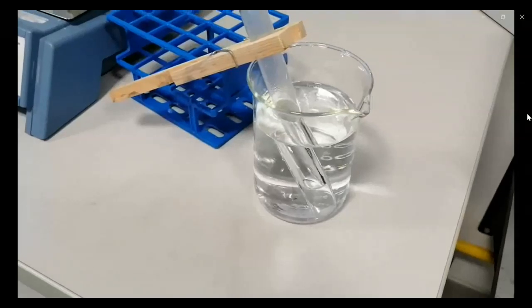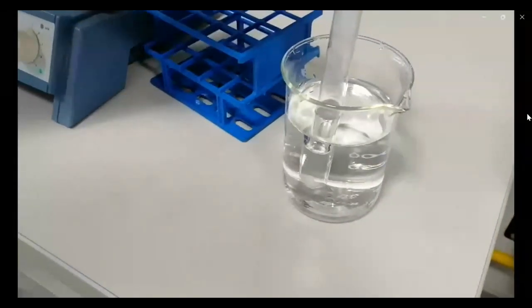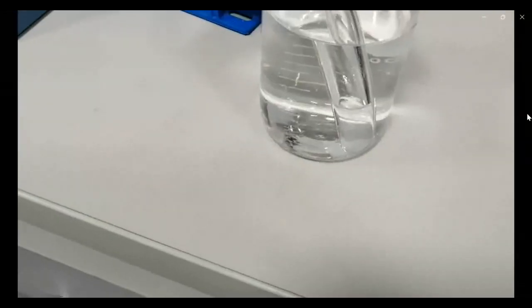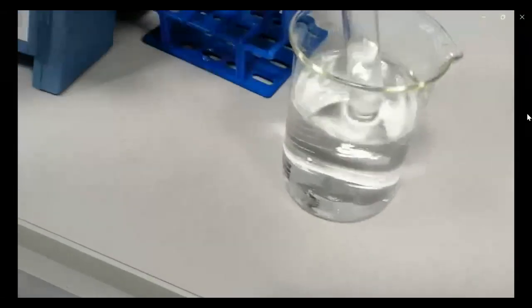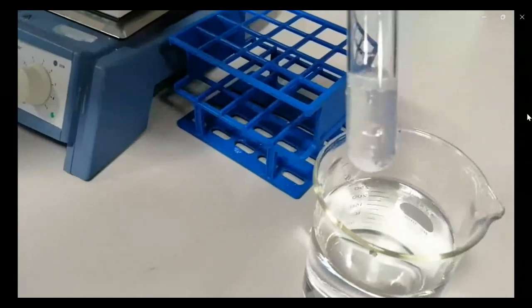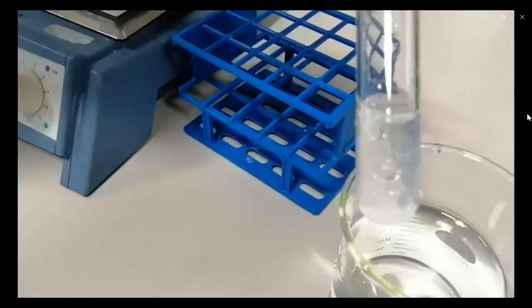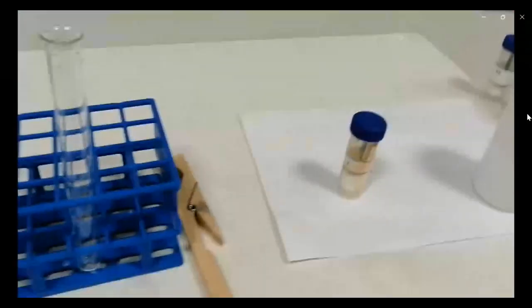Just mix them again, and you can see the crystals start to re-precipitate. The turbidity starts to appear. You can see that. So lead chloride is precipitated in the cold.